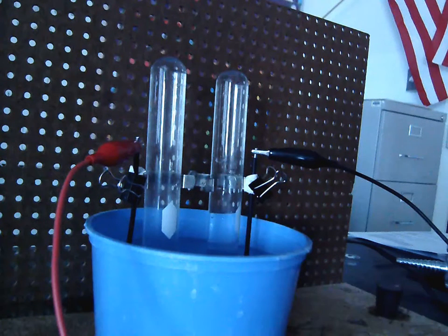It's very important that we understand what we mean when we say decomposition, so that you have some insight into what this lab is going to be all about. The word decomposition means to break apart. So in this lab, what we're going to be doing is taking a sample of water and decomposing it, or breaking it apart into its individual components.